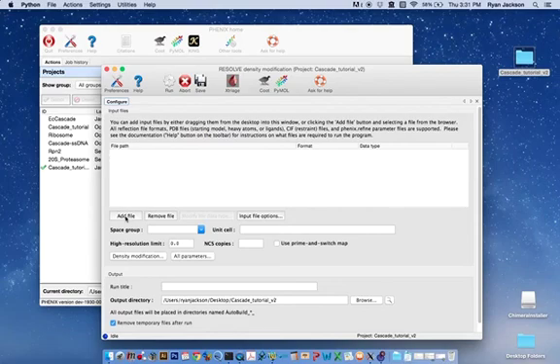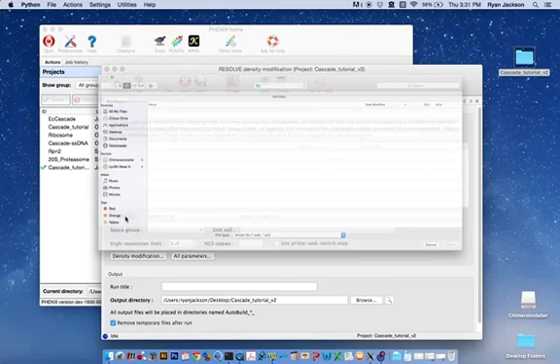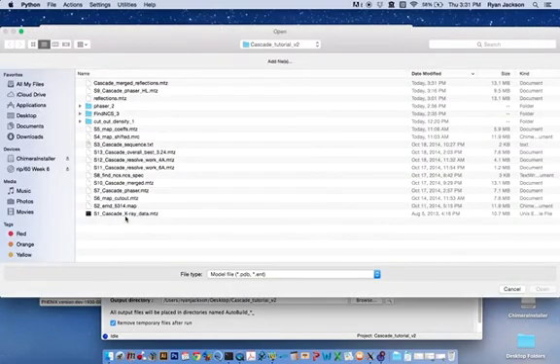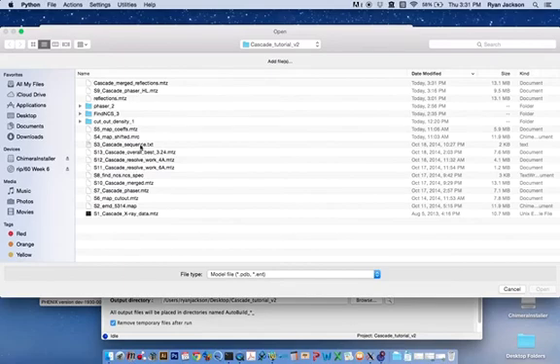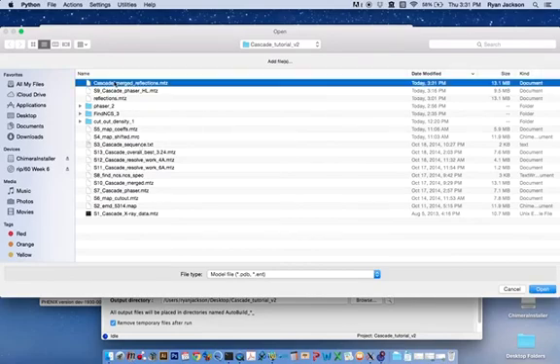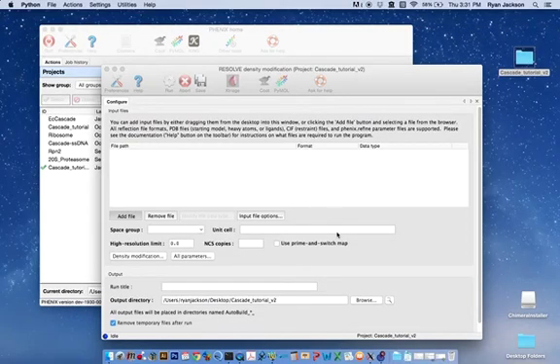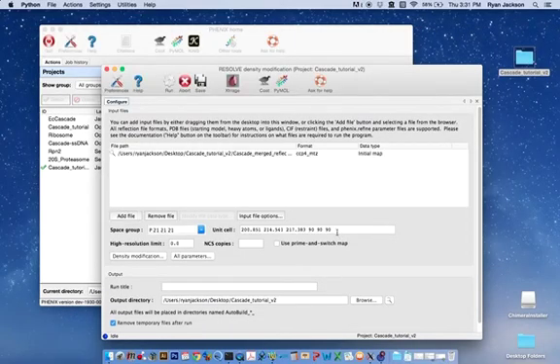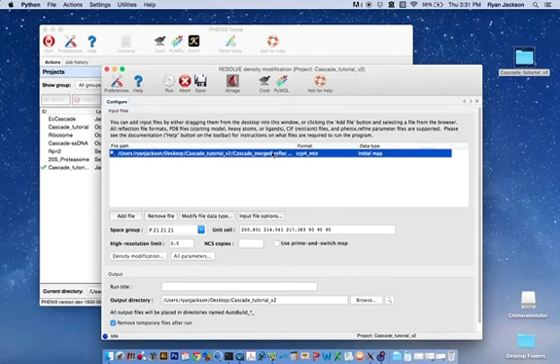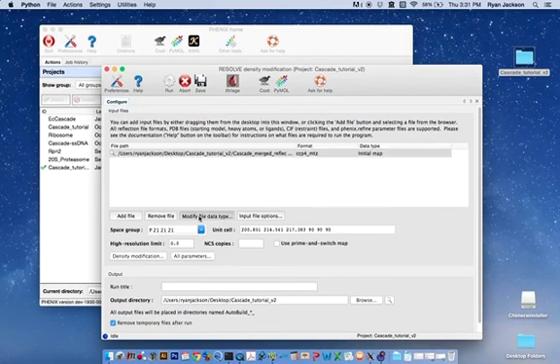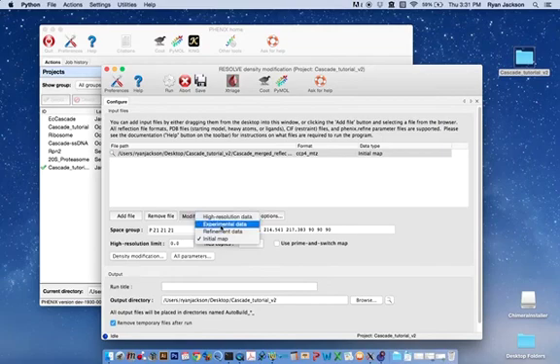Here, we add the file that we just made, the cascade merged reflections. The first thing we need to do is modify the data type of this file from Initial Map to Initial Map and Experimental Data.